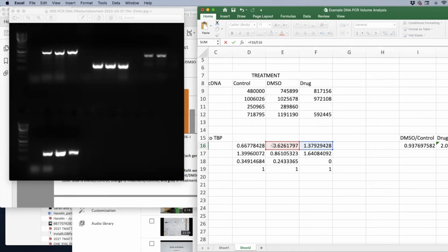So anyone who had stuff not show up like it was supposed to, the real solution, if this was a real lab situation, is you would rerun the whole thing, which people can if they want to. You would just have to do it in the background of what else we're doing every week.